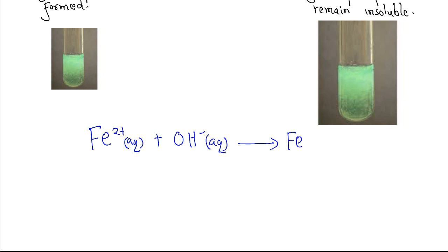This is due to the reaction between iron 2 ion with the hydroxyl ion from sodium hydroxide solution to form iron 2 hydroxide, which is in solid state.